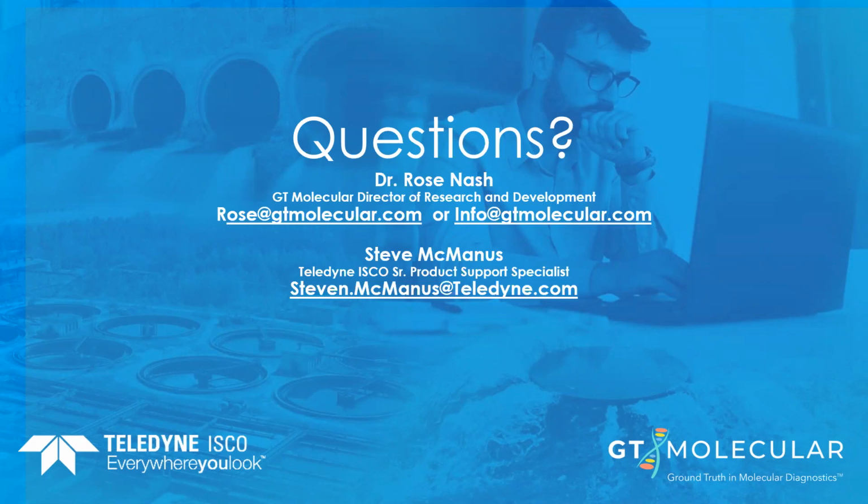Sure, thank you. That's a great question. We have a lot of people who come to us, oftentimes universities, that are very interested in getting started with this type of testing. We always recommend using an autosampler, just again, because of the quality of the data, as we just discussed. So at this point, when someone first comes to us, we usually connect them with our friends here at ISCO or other groups that rent ISCO samplers. And then all of our offerings are, as you mentioned, standardized.